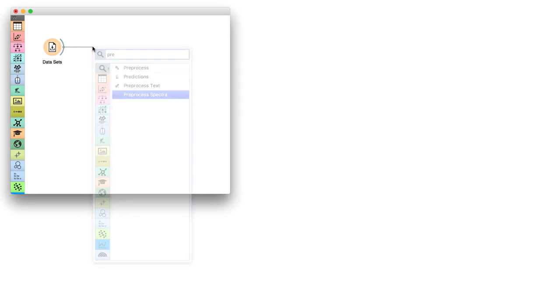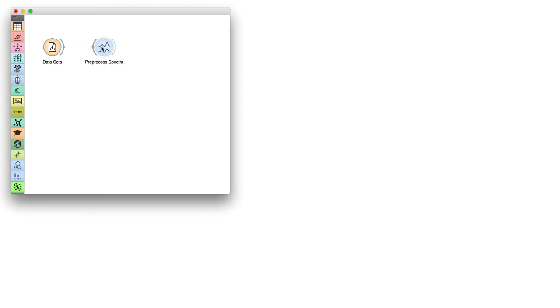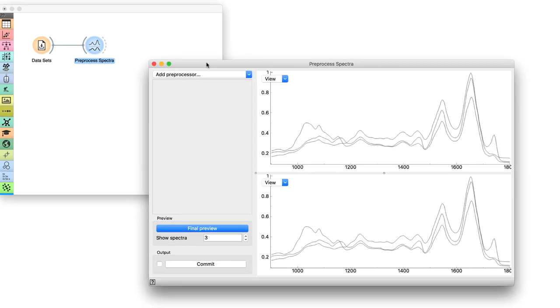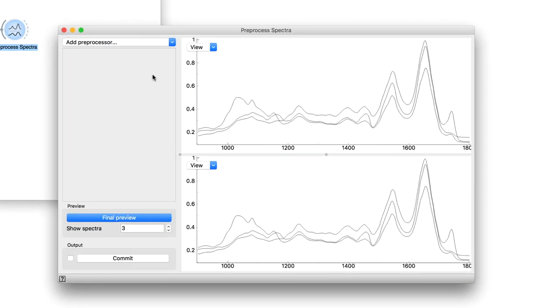Next, connect datasets to preprocess spectra and open the widget. We see a few spectra randomly selected from the whole dataset.